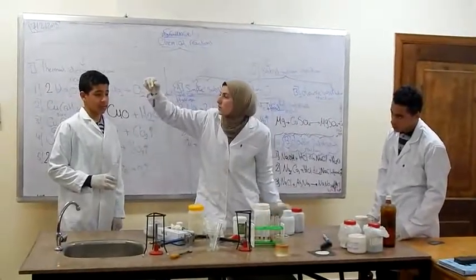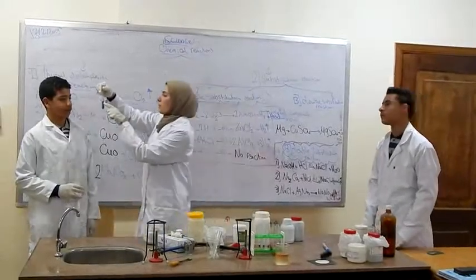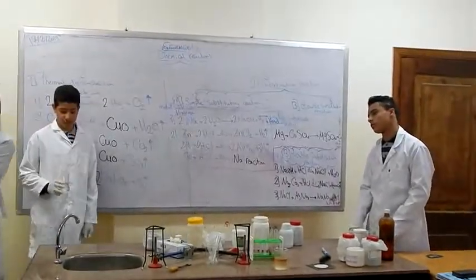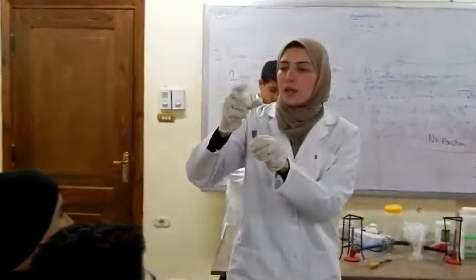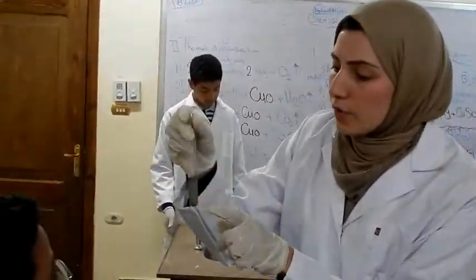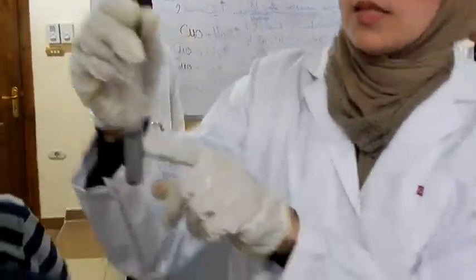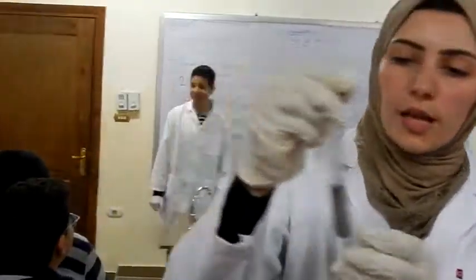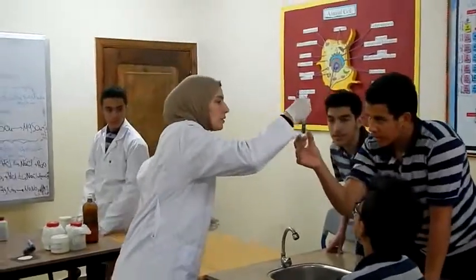Look. Bubbles are forming. These bubbles mean zinc has reacted with hydrochloric acid and a little amount of hydrogen gas is evolving. Okay?